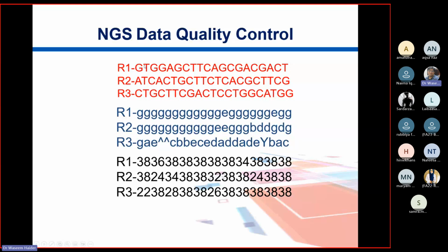So you are taking those bases and calculating, for position number one, all reads, you take all those reads and stack them together, like plates in a container or in your drawer where you put your utensils. So we have those nucleotides on position number one. Their composition is G, A, C, so 33% each, so three of them.